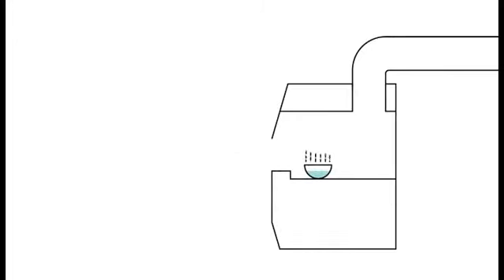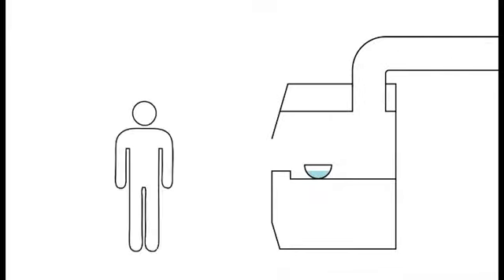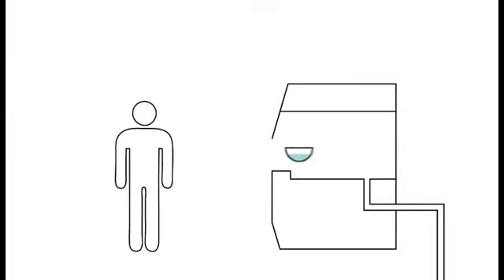When using chemicals, be sure to do so in approved fume hoods or wet benches. Both have special ventilation to pull the fumes that are released up and away from you. Another benefit of using wet benches and fume hoods is spill containment. Using chemicals outside of them can be dangerous.